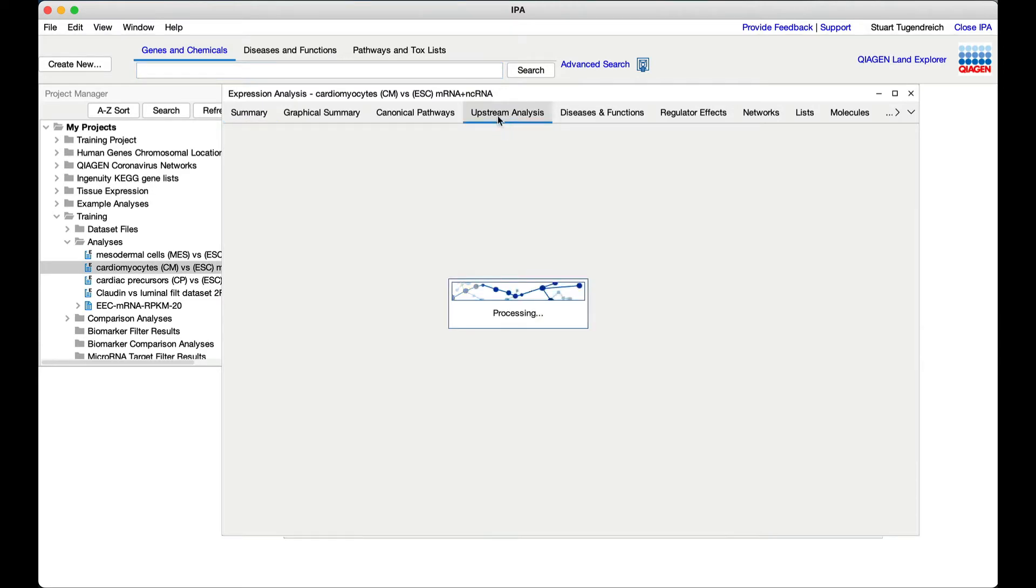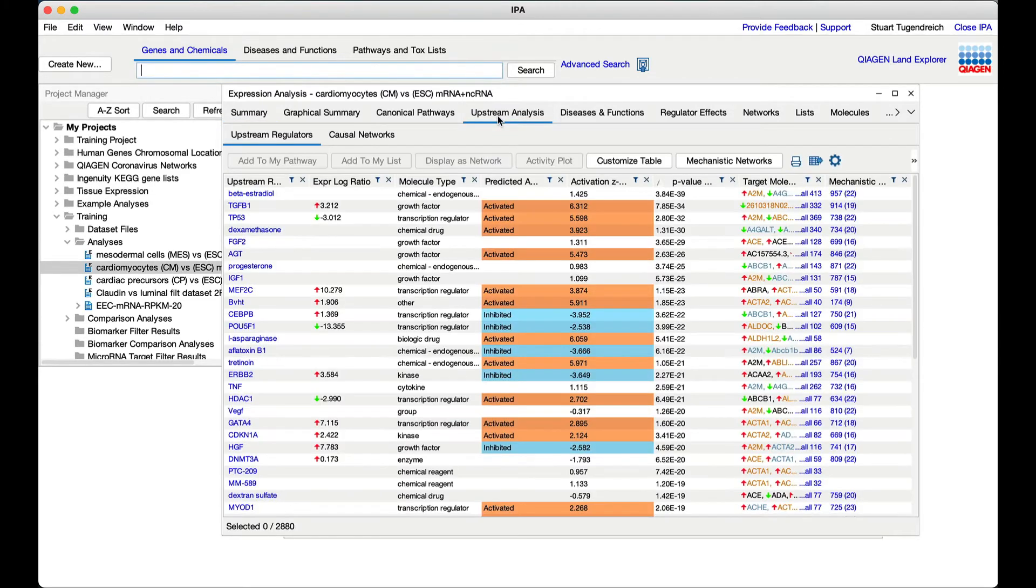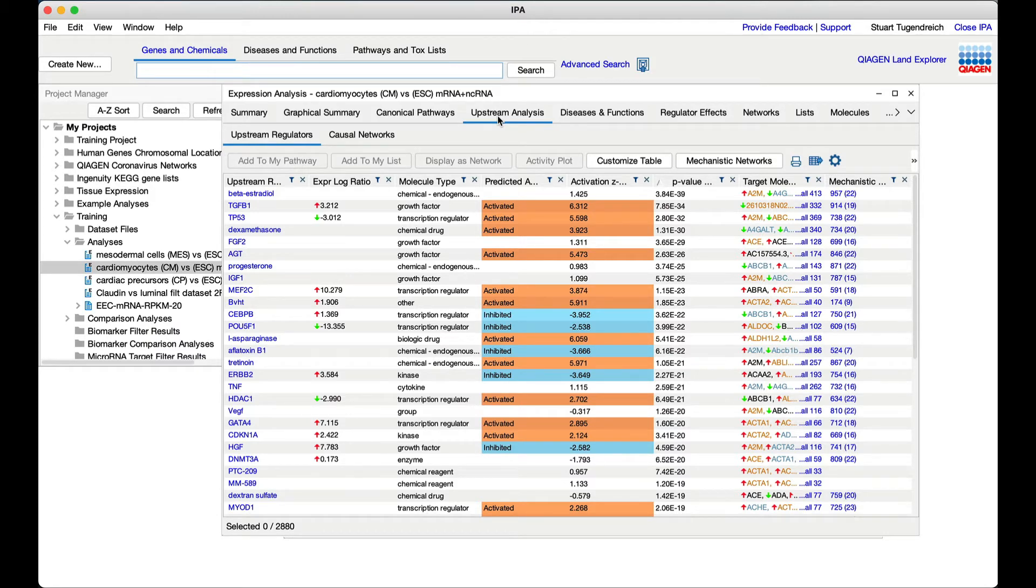Click on the upstream analysis tab. Each row represents a different predicted upstream driver of the expression of genes in the dataset. The table is sorted by p-values by default, where the most statistically significant upstream regulators are at the top of the table.